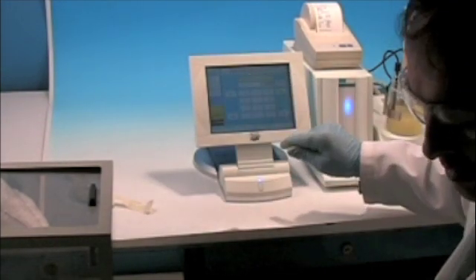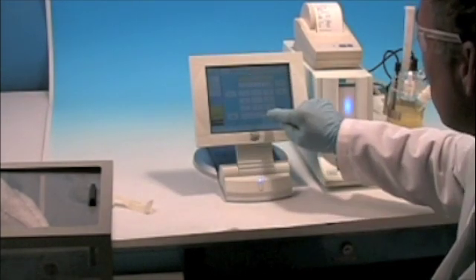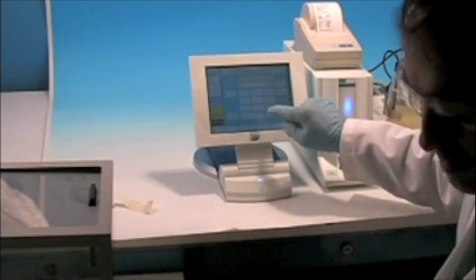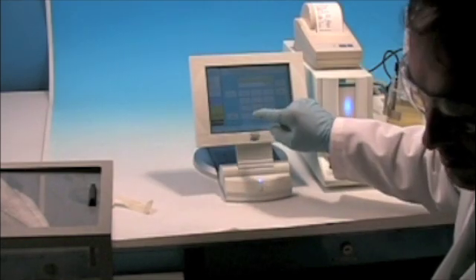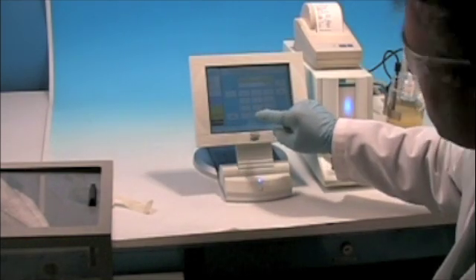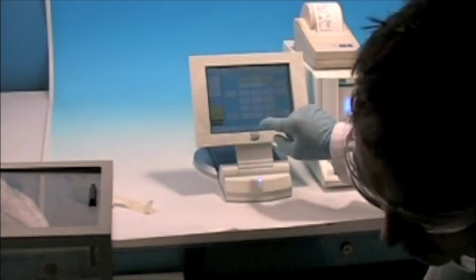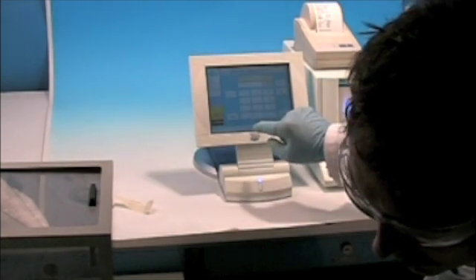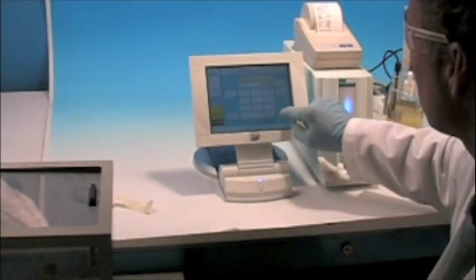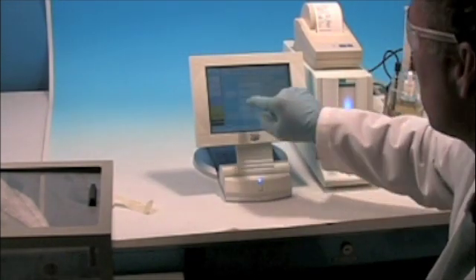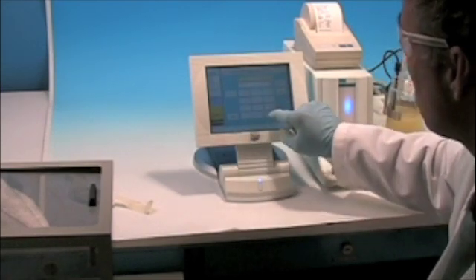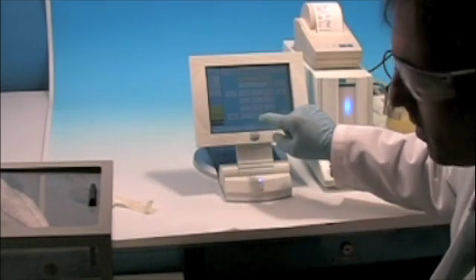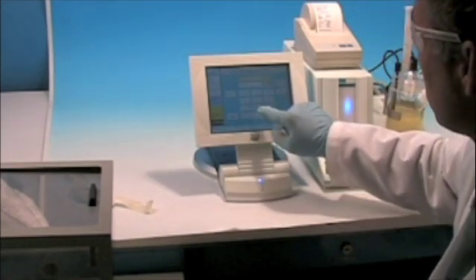So we've got weight one: 3678. Weight two is 4442.